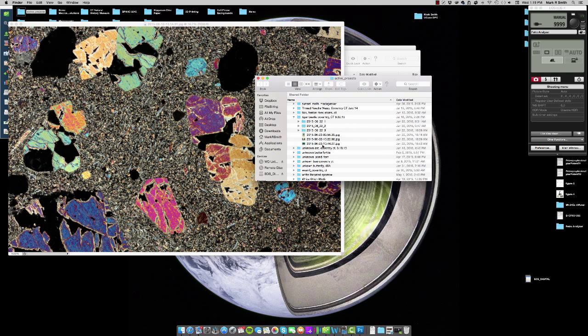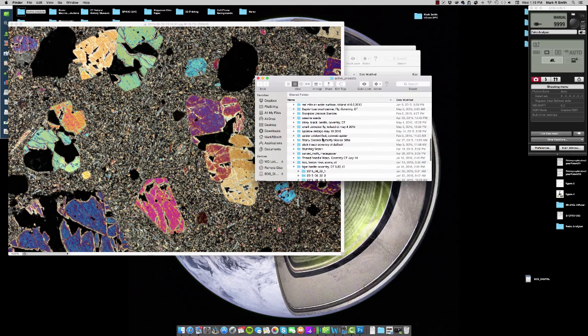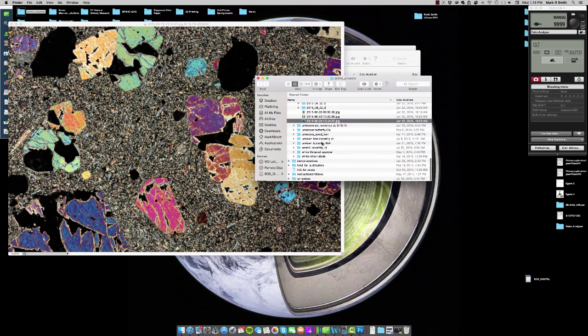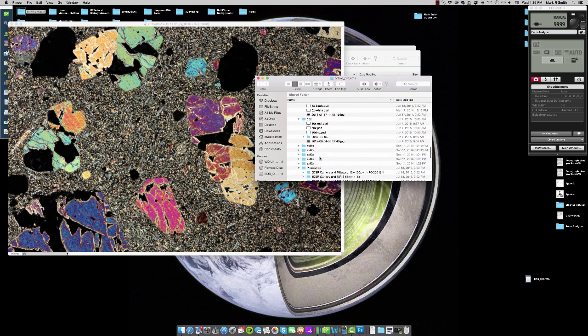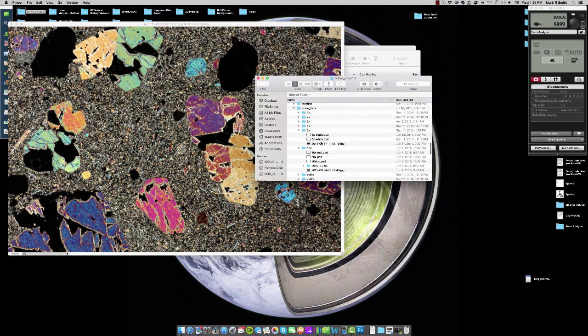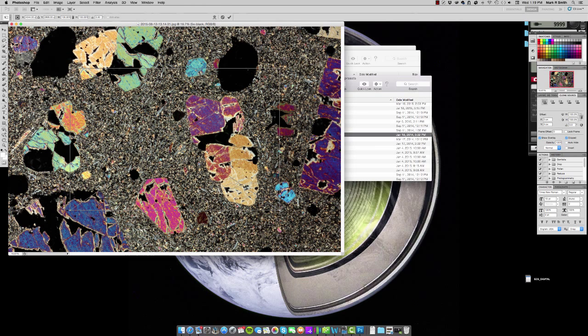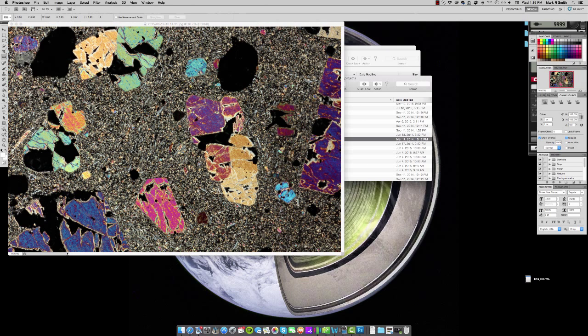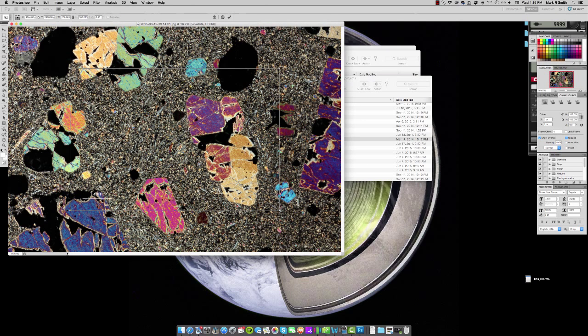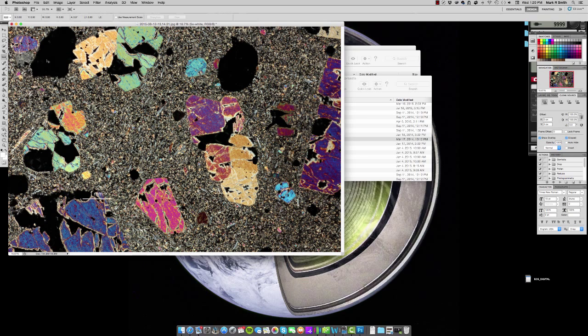So I've also got these preset scale bars that I've gone ahead and made that are formatted to the particular lens that we're using which is a MPE 65 1-5X. These are also available on our website under the download section if you do or are using this lens.